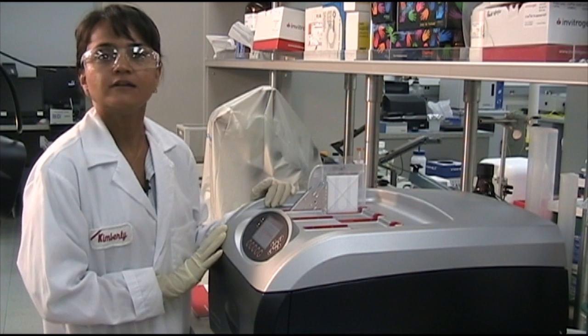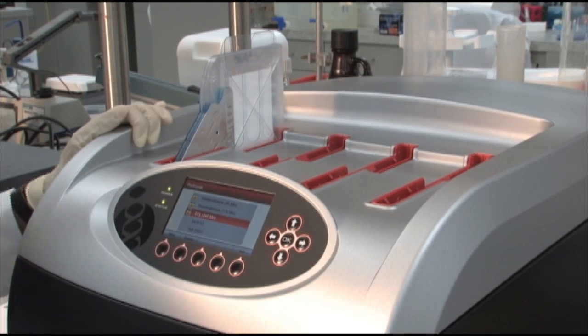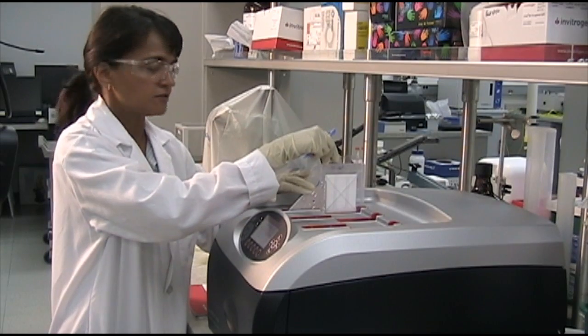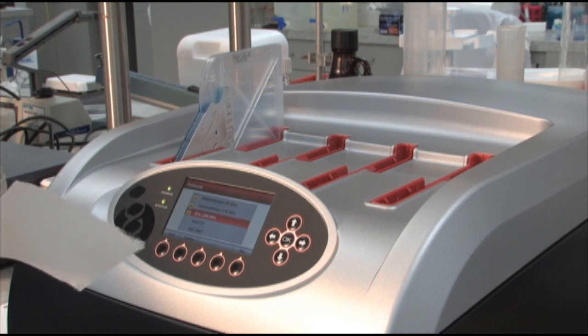When the protocol is complete, the blot does not dry out because the instrument holds the blot in the final solution. Then simply press complete, which will drain out the solution. Then remove the blot from the holder and you're now ready for detection.